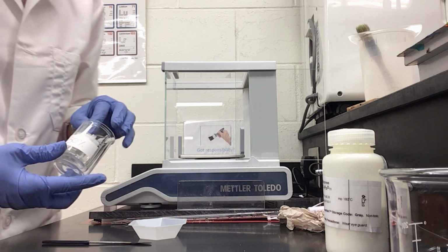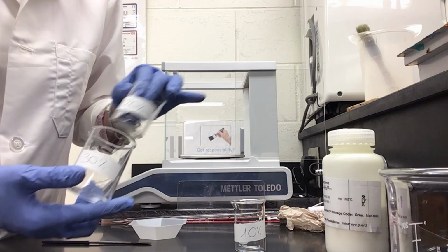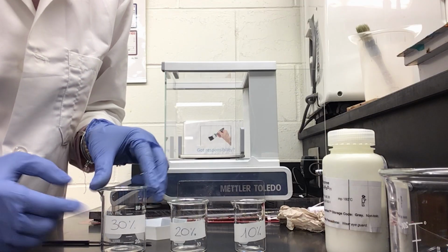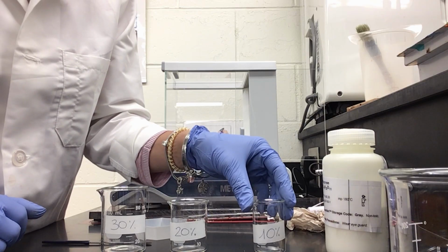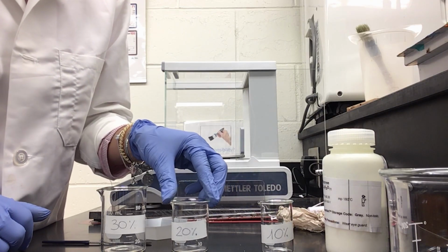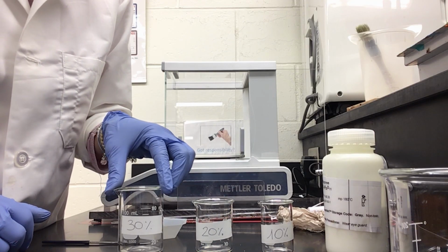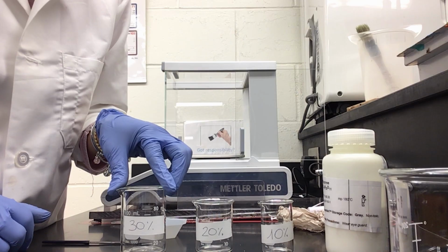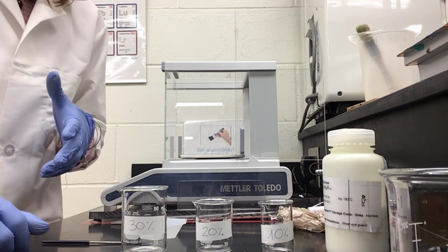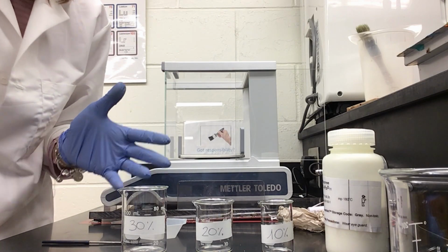So I pre-labeled 3 beakers. I just used some tape and I wrote on the tape. So I will use these for the 10% sugar solution, these for the 20% sugar solution, and these for the 30% sugar solution. So how do you weigh a solid using a balance?